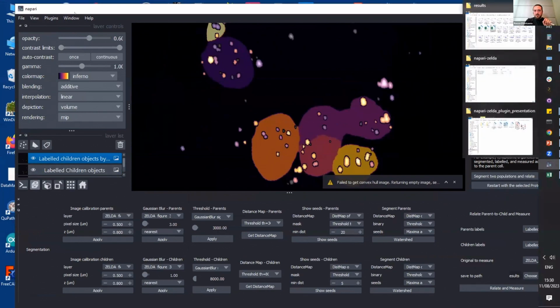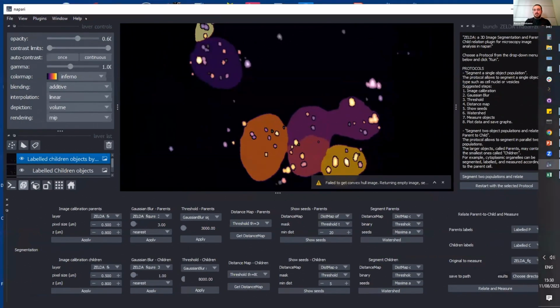Now, I will take some questions if there are any. I didn't see the chat, or I can continue and explain another protocol. That is fine. Tobias, can you just? Hey, Rocco. Yes, there is a question by Monara in the chat. And if anyone else wants to ask a question, you can also just raise your hand and then unmute yourself.